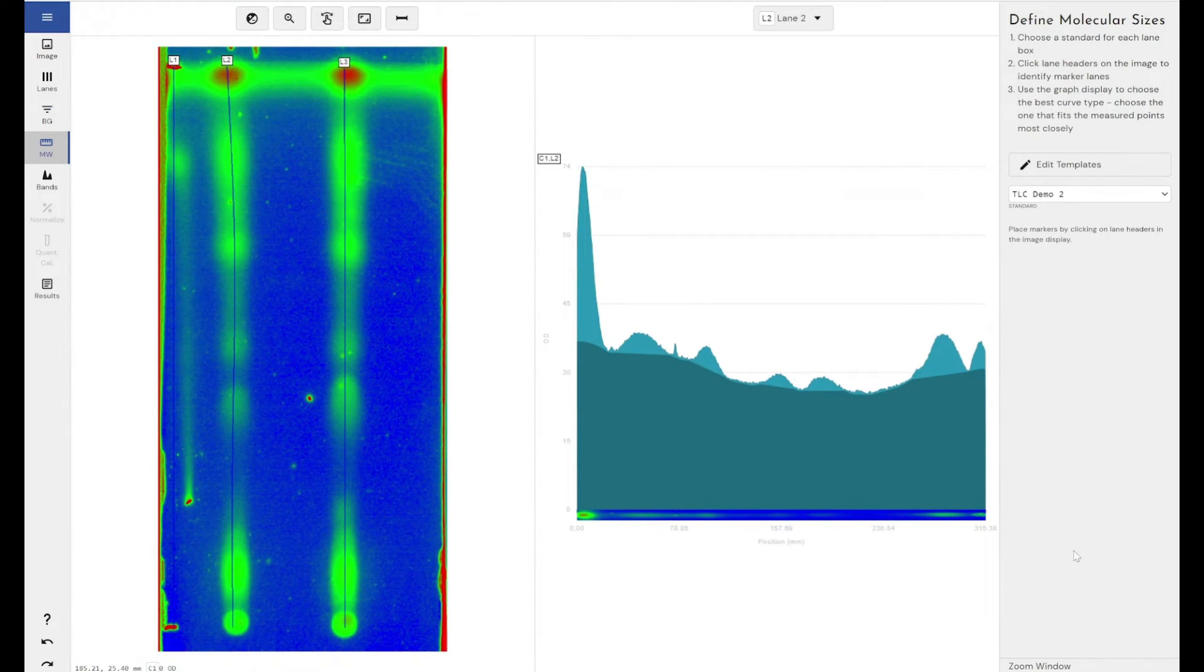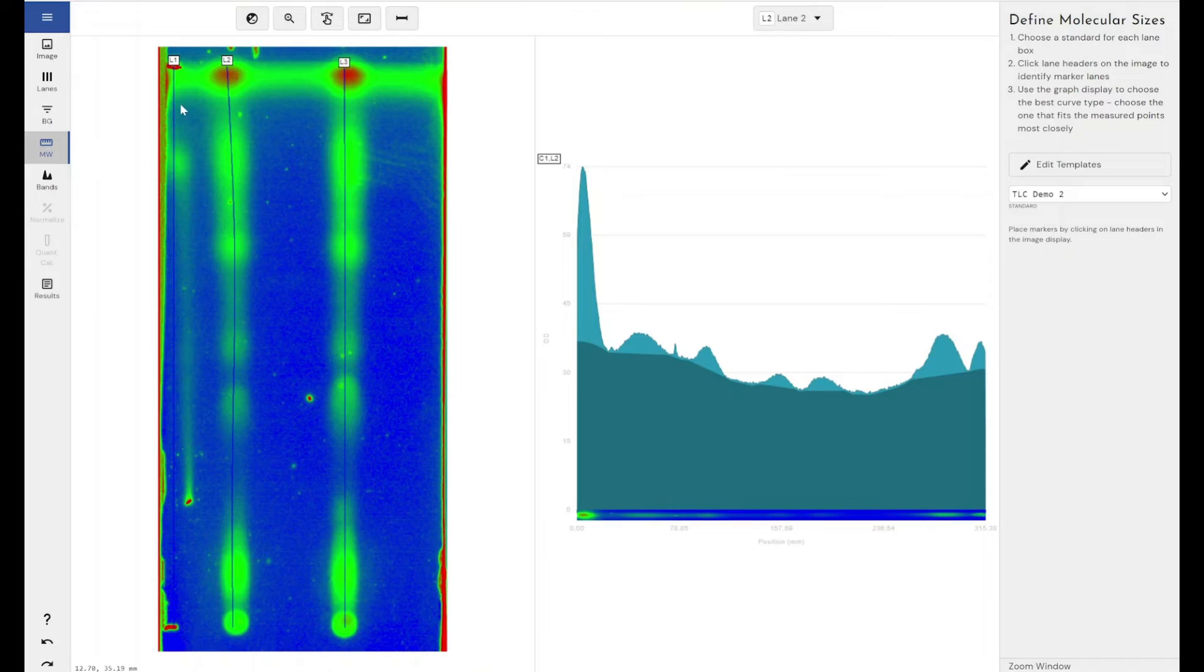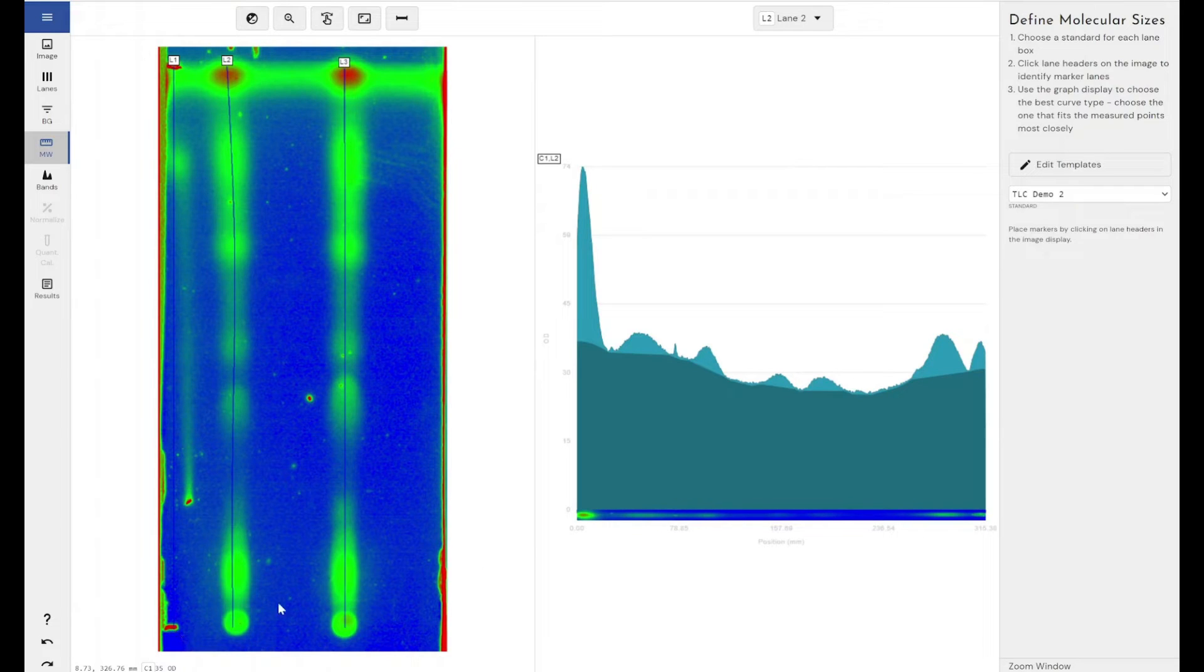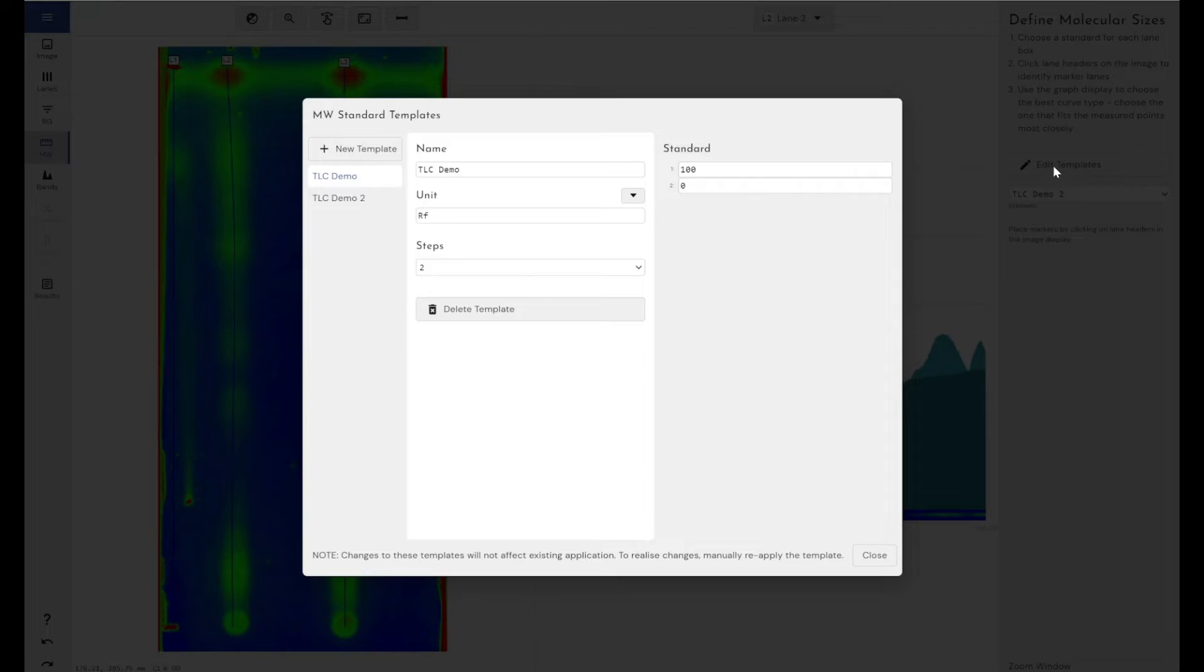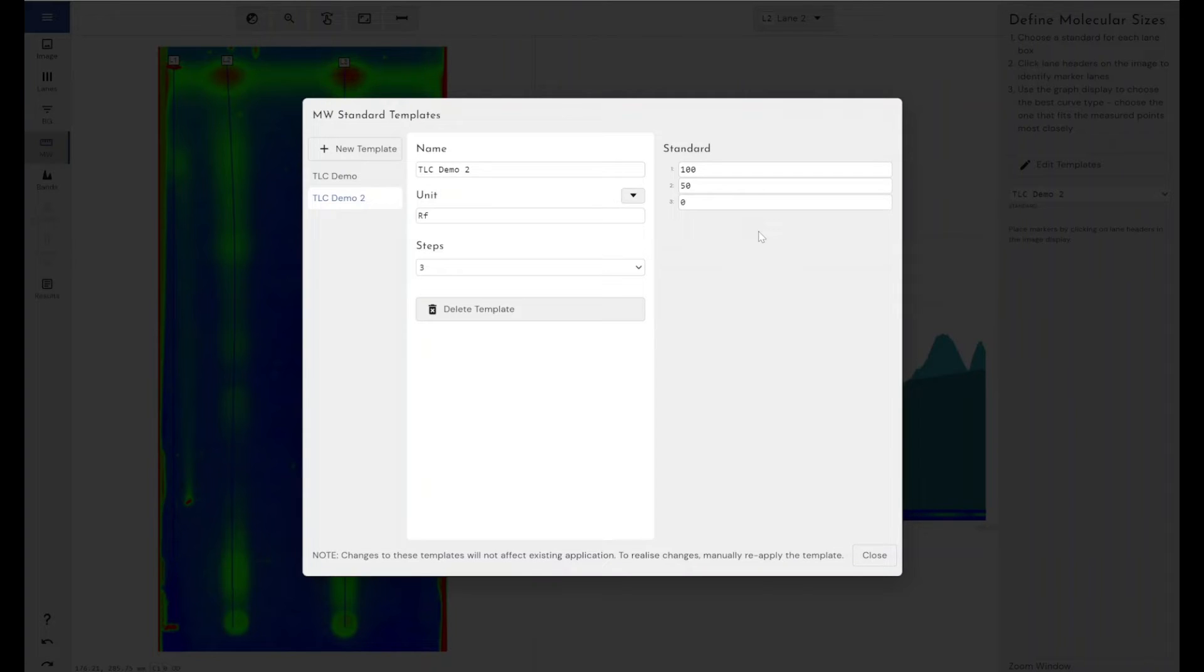Coming through to the molecular weight section of Phoretix 1D workflow, this is where we're going to define the start and end points of our sample and our solvent. This is the two points that we're going to use to calculate our retardation factor. And I'm going to apply those markers to my lane one, because obviously I've got my pencil markers from when I've actually run my experiment to say where I put my sample and where my solvent front ended up at the end of the experiment. Now, to do this, I've created a template with the units of RF, and I'm going to be using this one that's got three steps in it rather than two. The difference being that when I've got three steps in my ladder that I'm going to use to calibrate the RF value, it allows me to fit that to a calibration curve.